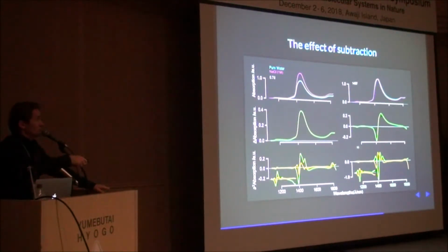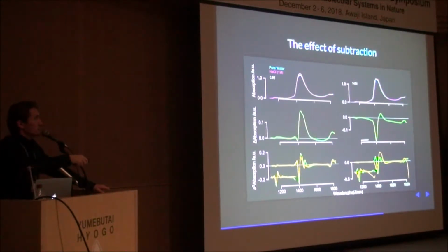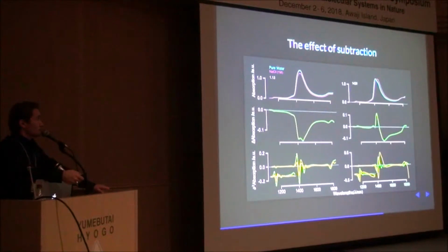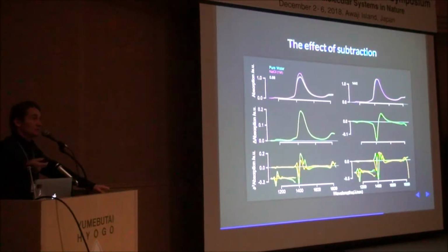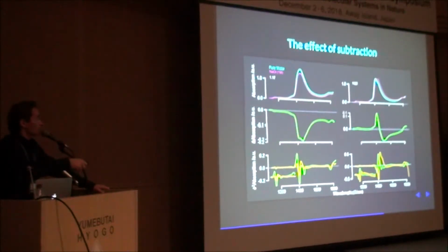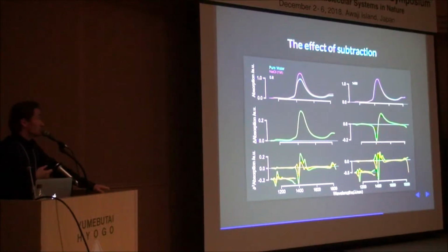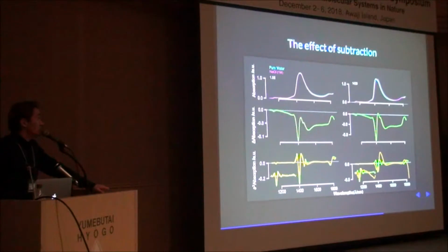So what we did is we used these spectra to fine tune and to find the closest spectra, the spectra with the smallest difference, with the smallest area under the curve. In that way, we were able to visualize these bands. The bands that we get from the principal component analysis, we can now see them. And again, the same thing with the derivatives here. So by changing the distance between the water that you're subtracting and your sample, you can dramatically improve what your spectra look like. And that's the basis of our proposal here, that we can do that.